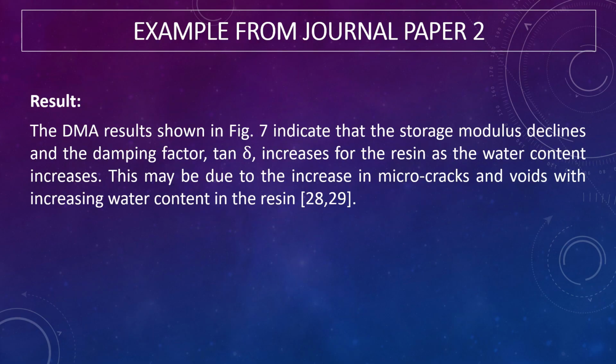This result indicates that the storage modulus declines and the damping factor tangent delta increases for the resin as the water content increases. This may be due to the increase in microcracks and voids with increasing water content in the resin.